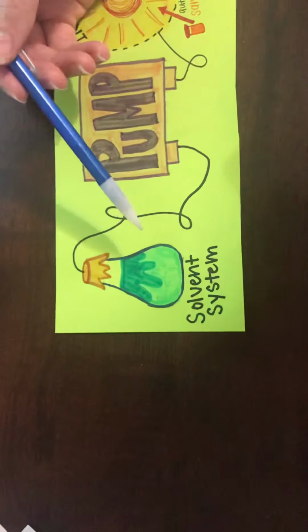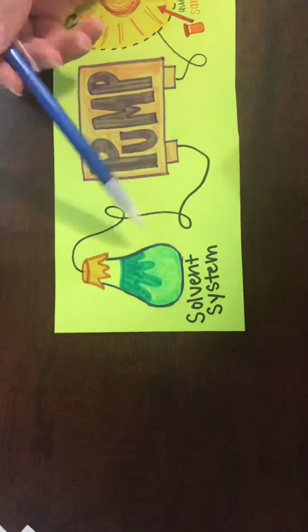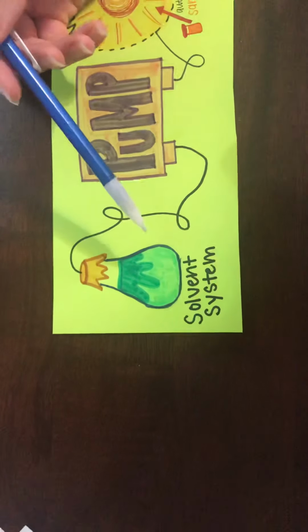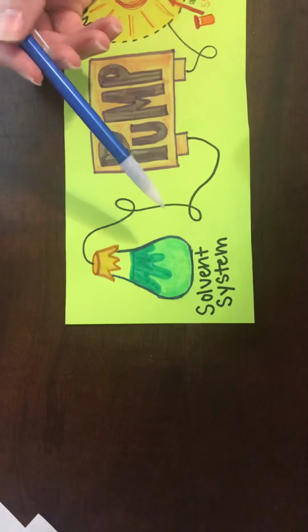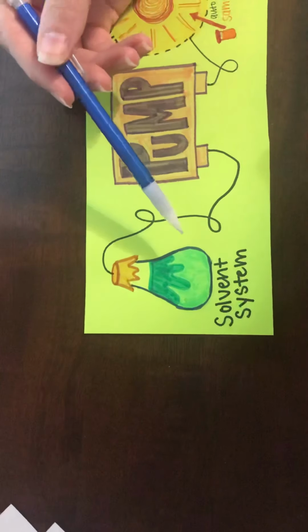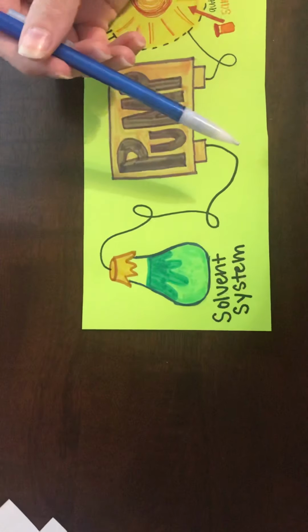One thing that we must make sure of is that the solvents that we are using in our multi-solvent system are miscible with one another. Miscible means that they will mix together and form a homogeneous solution, because if the solvents are not miscible with one another in the system, they can form globules in the column, which clogs up our column.